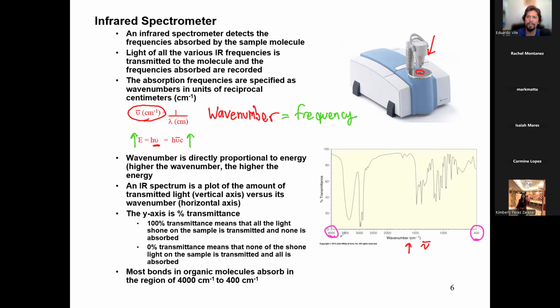And energies of what? This whole time I've been telling you we're going to use IR to measure something. What are we measuring the energy of? Any guesses?